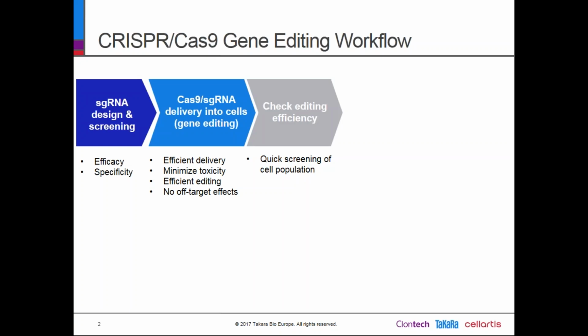Following the gene editing, there are also several tools for a quick screening of the cell population, just to quickly check if the editing has been efficient prior to the single cell cloning step, which can be a quite tedious step and a long step in the workflow, in which you will need to maximize the survival of your single clones.